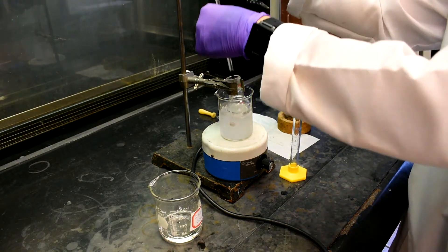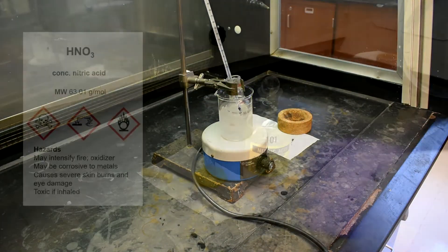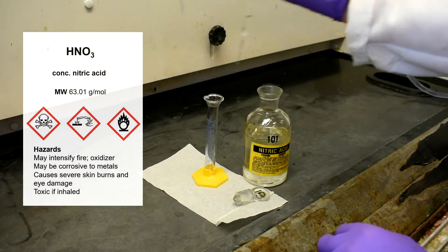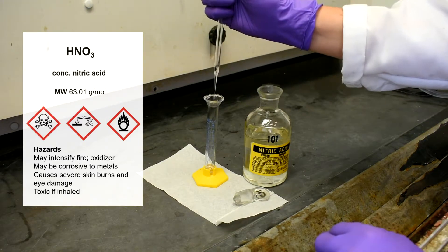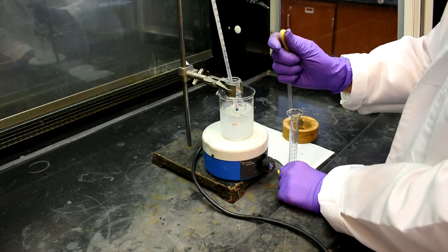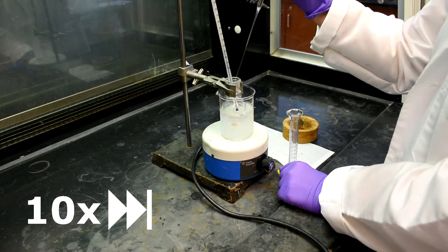Place the thermometer in the flask. Measure out 1ml of the concentrated nitric acid and cautiously add the nitric acid drop-wise to the flask. This step is to generate the nitronium ion, which functions as the electrophile in our reaction.